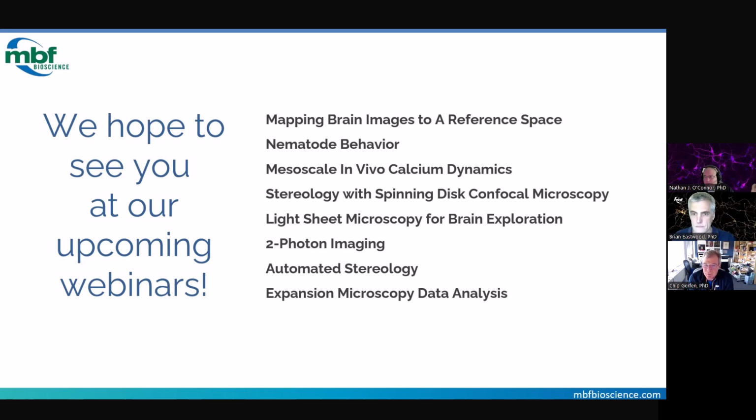That's important because when we do the reconstruction and then register to the Allen brain, as an example, it's necessary to make sure that the missing section is taken into account when we do the registration. Unfortunately, at this point, we're still working on that. We've been working on ways to take parts of sections and virtually put them back together.